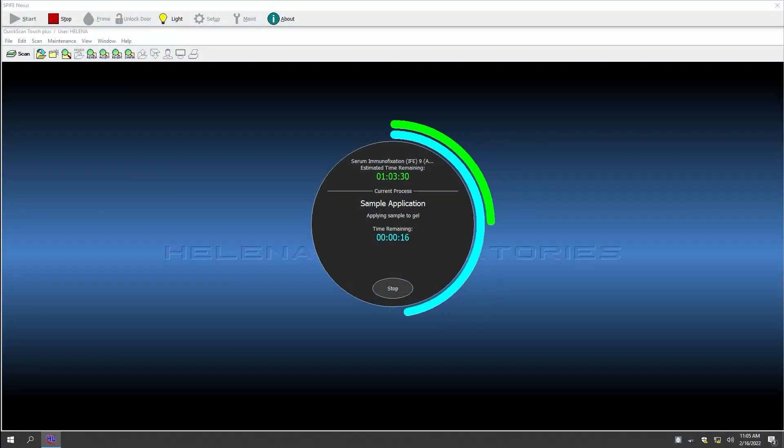The on-screen status indicator allows the user to check progress at a glance, indicating time remaining for each step and for completion of the run.